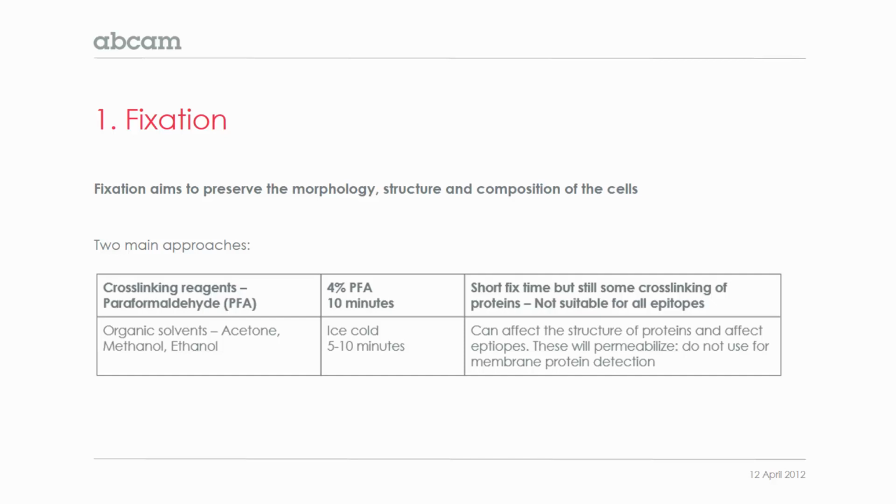For PFA fixation, we would recommend to fix in 4% PFA for 10 minutes only. This is quite a short fixation time, but there may still be some cross-linking of proteins, so it's not suitable for all epitopes. For organic solvents, such as acetone, methanol and ethanol, you need to use these at ice cold temperature, again for 5 to 10 minutes only, and you need to consider that they can affect the structure of proteins and affect the epitope of the antibody, and they will also permeabilize the cell. So we wouldn't recommend to use them for membrane protein detection in normal circumstances.